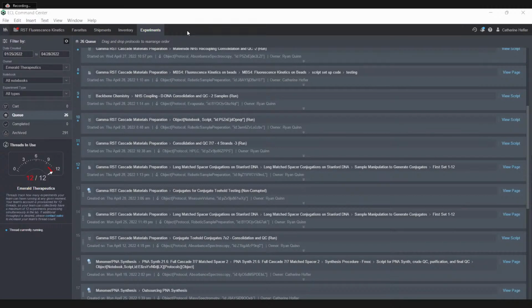So you can see why we're excited every time you guys add features. We're so excited when we can plan the whole reaction network. That's basically what you do in total synthesis: one, sit down and plan out what reactions you're going to run, and two, physically carry them out in the lab. And if you could do all of that in a notebook, that's straight up science fiction.